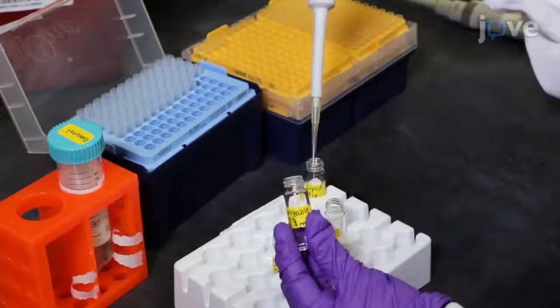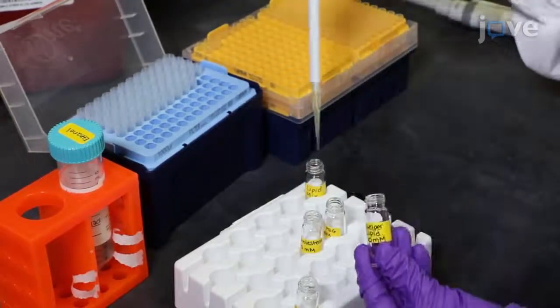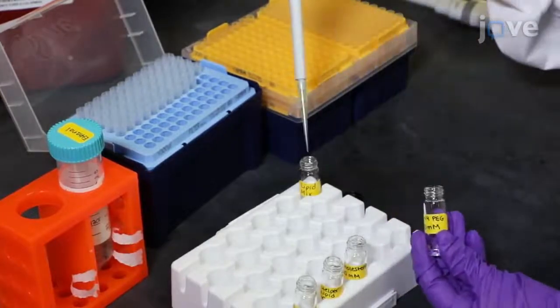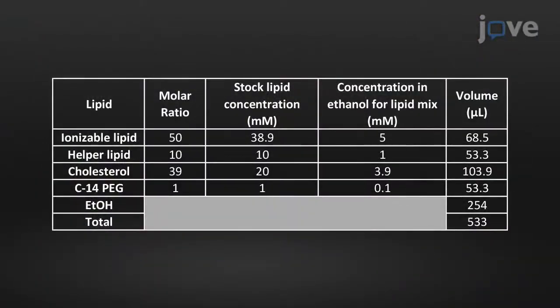Begin by adding the appropriate amount of each lipid stock solution to a glass vial with intermittent vortexing as indicated in the table.